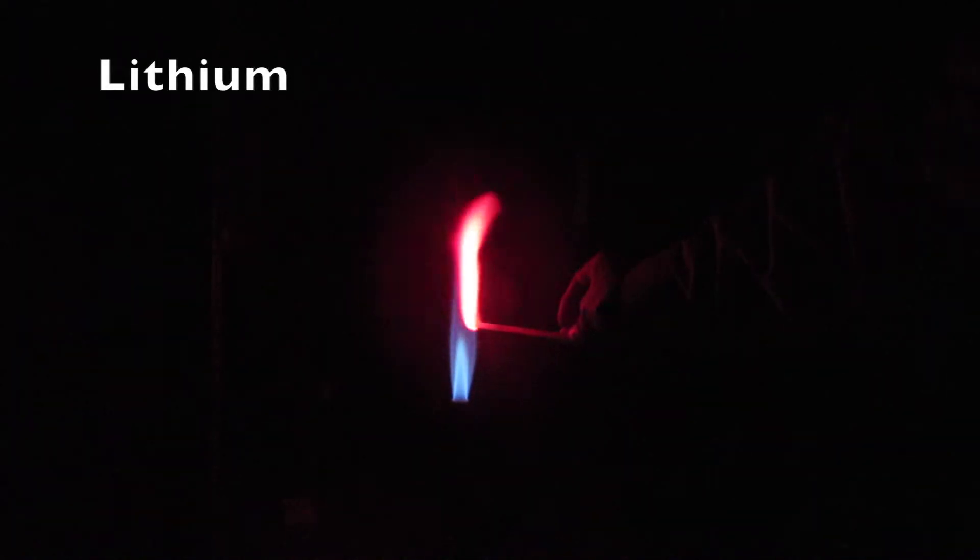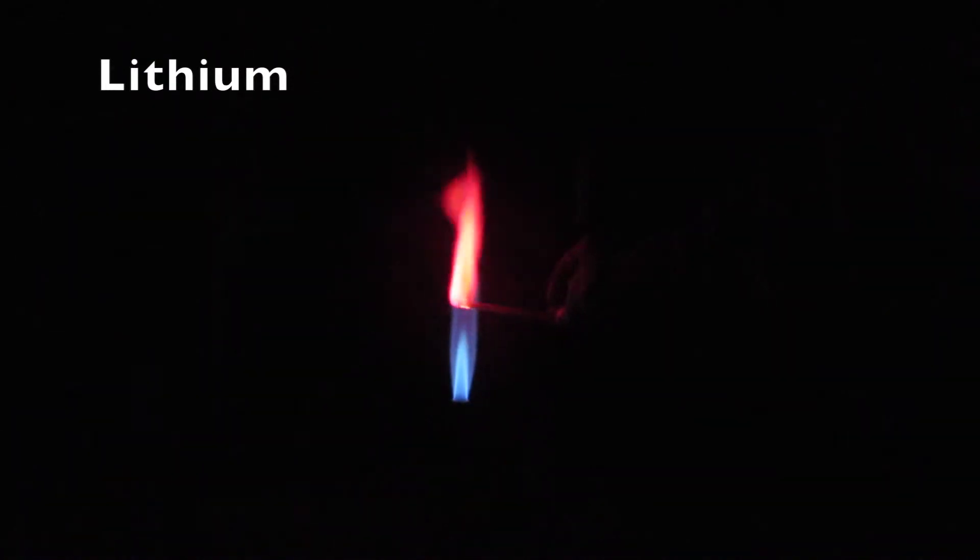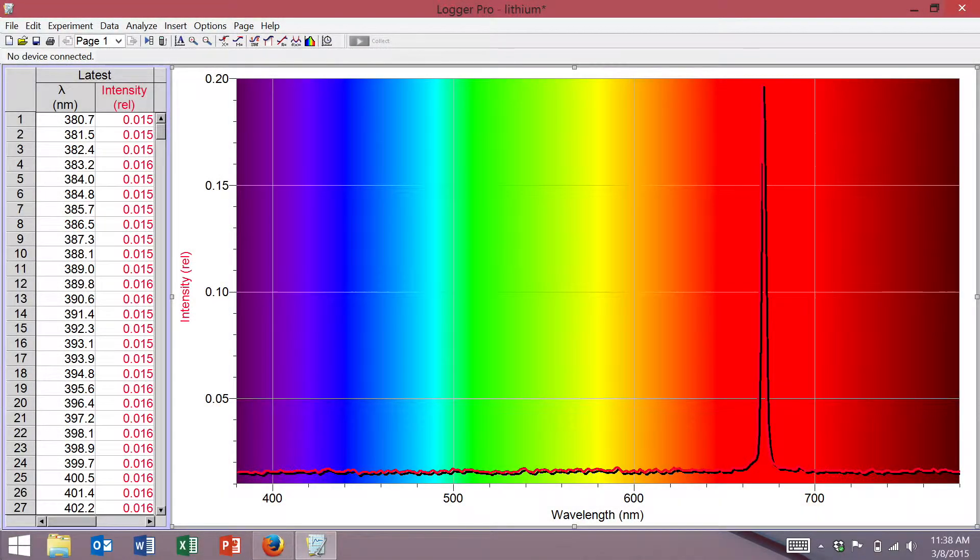First up, we have lithium chloride. You can see it's a very bright red color. The photons produced, as you can see by the photo spectrum here, are about 675 nanometers, give or take a few.